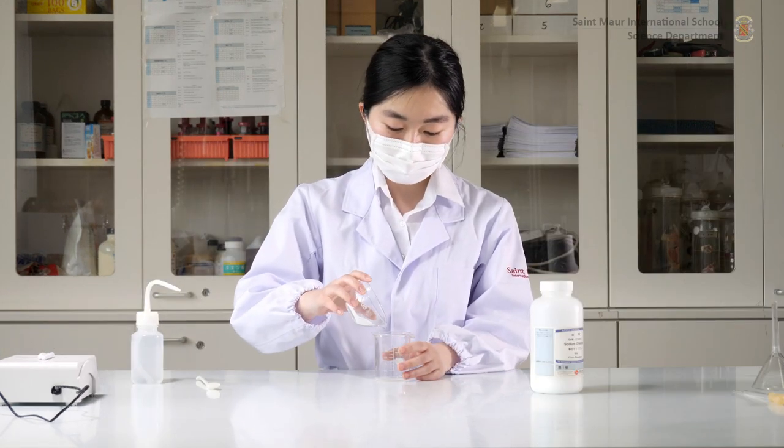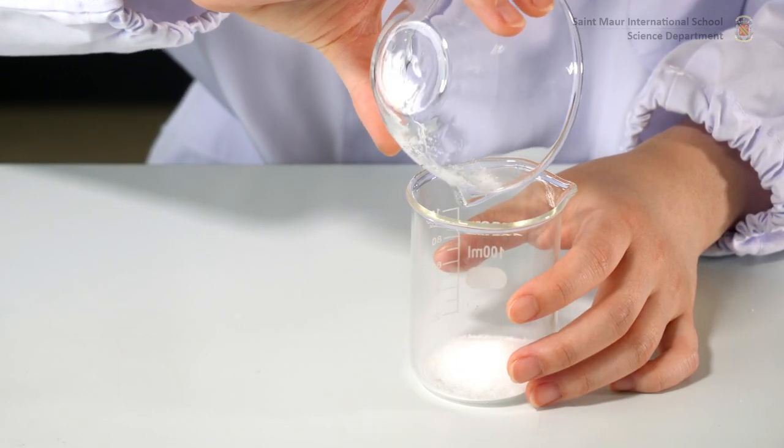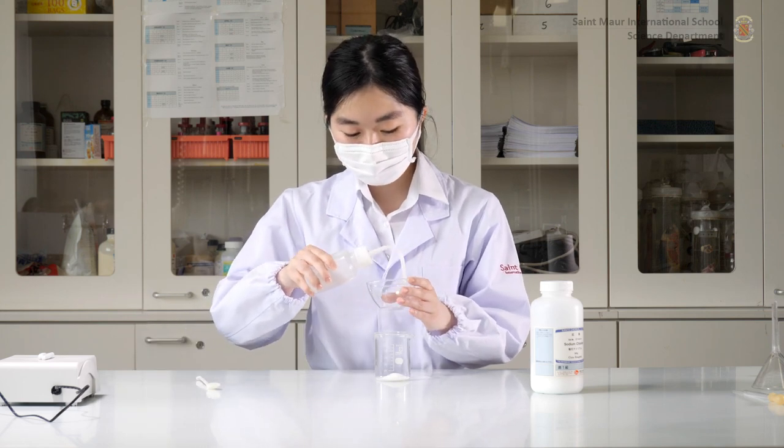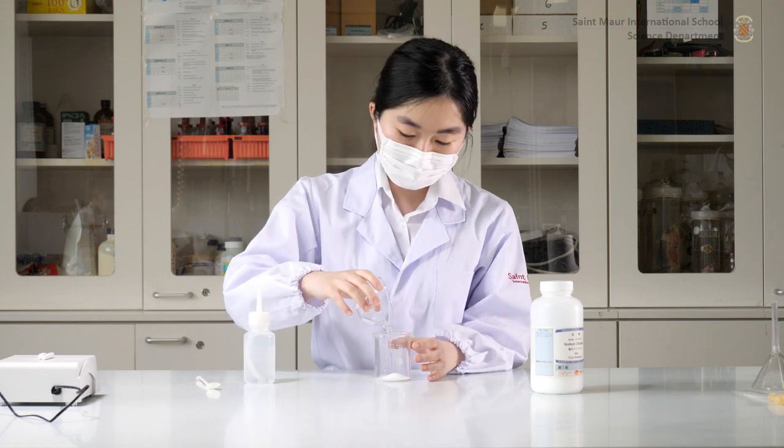Pour the solute into a 100 milliliter beaker. Use a wash bottle filled with distilled water to rinse the dish, making sure that you pour this wash solution into the beaker, ensuring that none of the solute is lost.